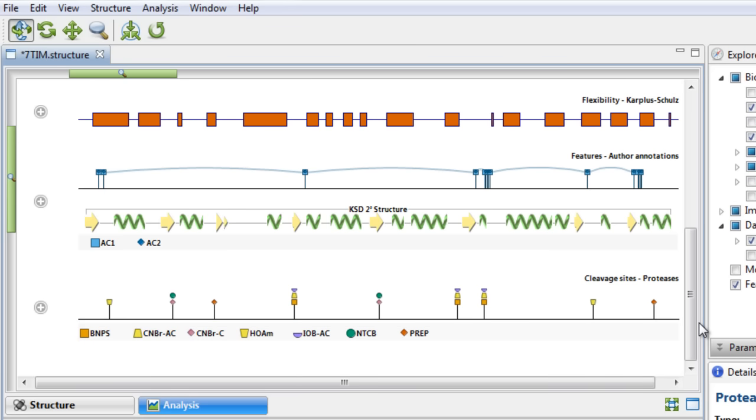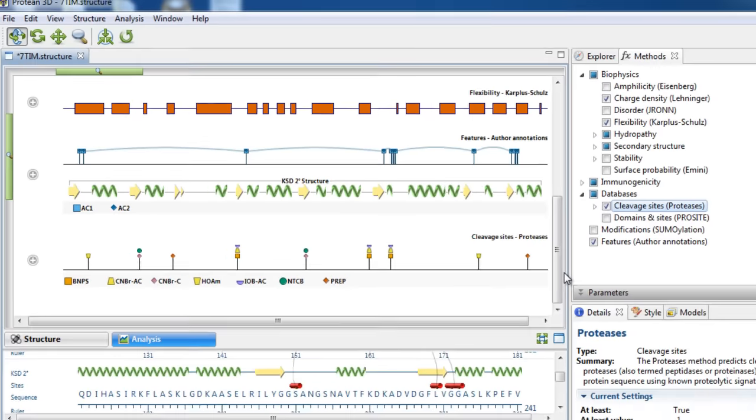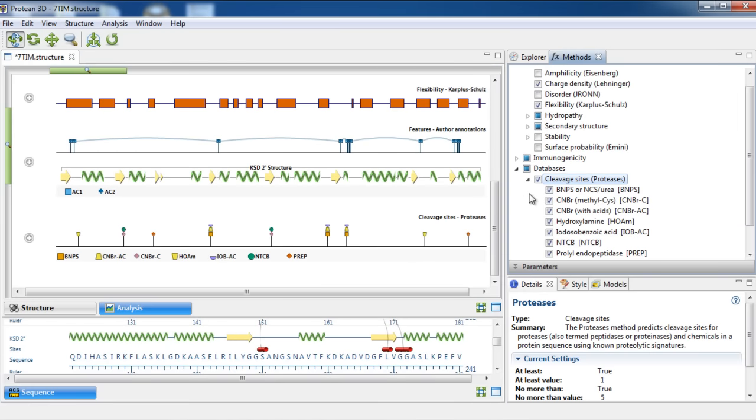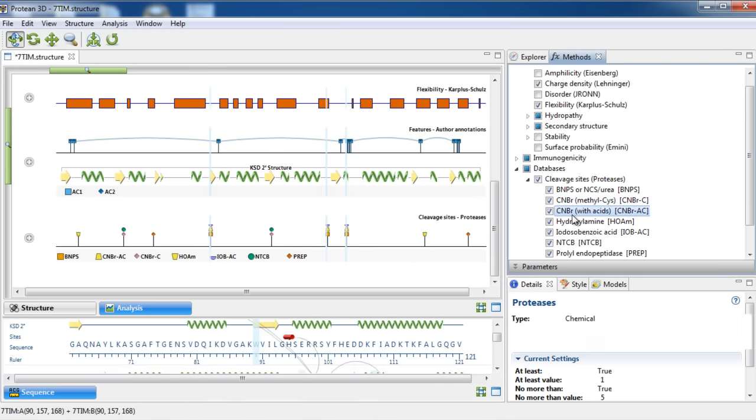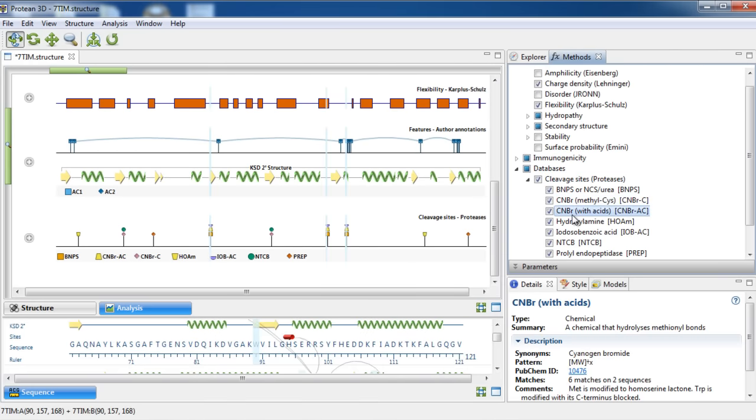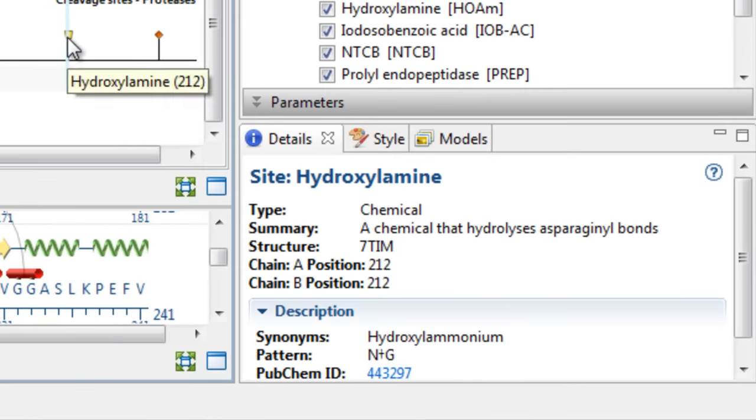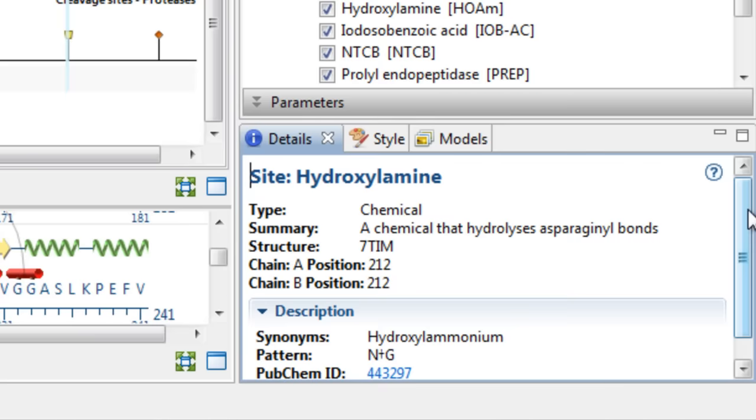You can also view in-depth information about each protease by clicking on its name under the Methods panel, or by clicking the pin in the Analysis view, and then examining the Details panel.